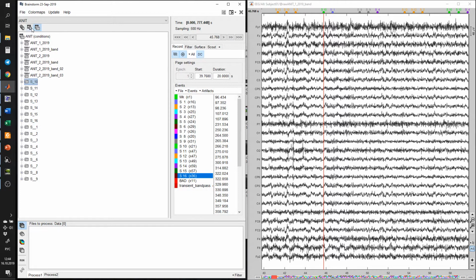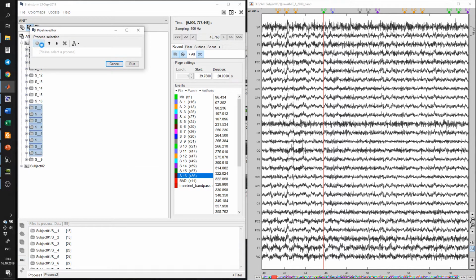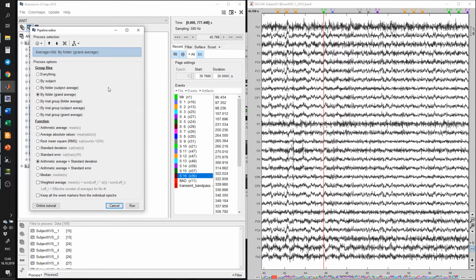I want you to do the next step. I want you to select your events from 1 to 8 and grab them here. Okay. Run. I want you to average them. Average files.